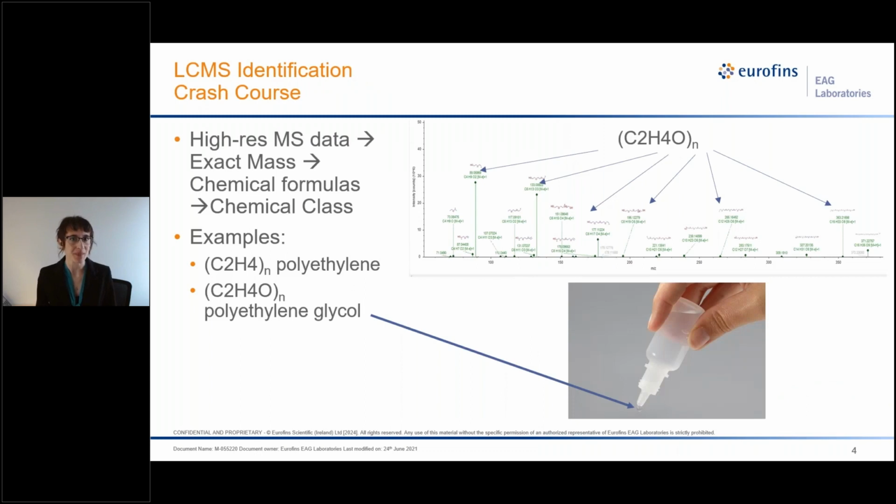For example, if I were to analyze eye drop solution, I might observe species with a chemical formula that consists of repeating units of 2 carbon atoms, 4 hydrogen atoms, and 1 oxygen atom, C2H4O. If this makes sense in the context of the other data from our E&L study, I could identify the species as polyethylene glycol, which is a likely component of the eye drop solution itself, as polyethylene glycol forms a water-soluble gel that's useful as a lubricating agent.